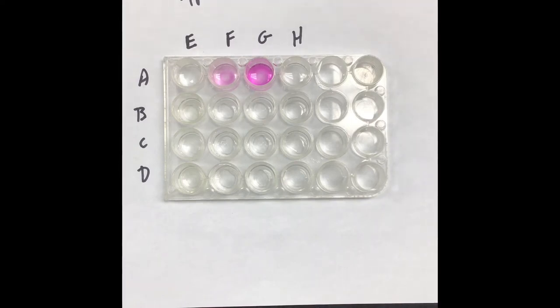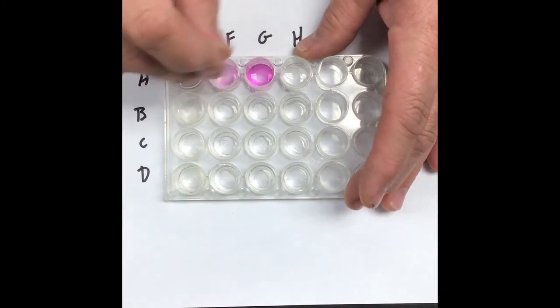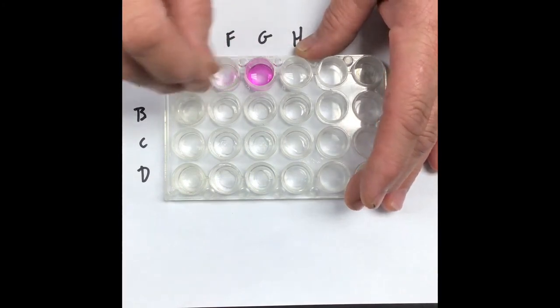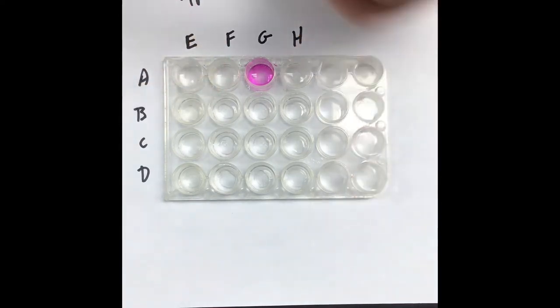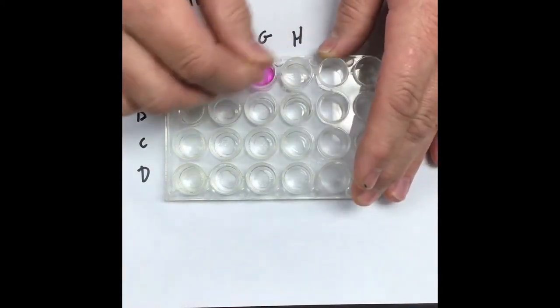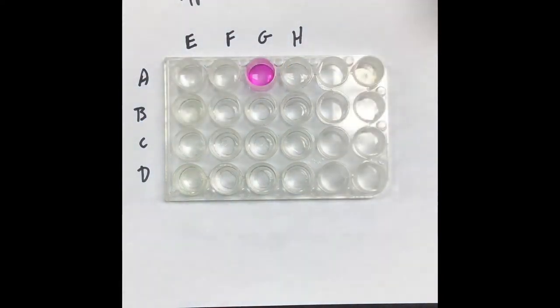I'm going to kind of stir them up just a little bit. We saw that actually did make a change. I can't tell you what that means, but maybe you can. Okay, so we know F and G changed. I'll stir those up a little bit just to make sure we know what's going on.